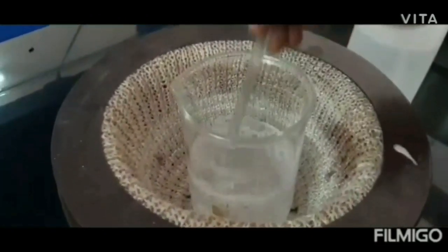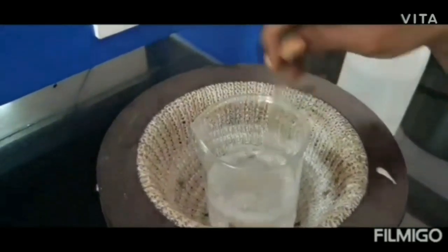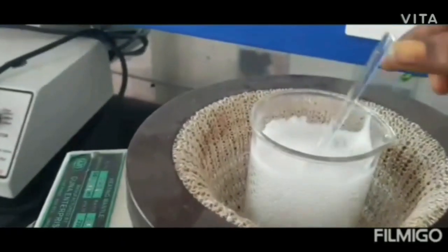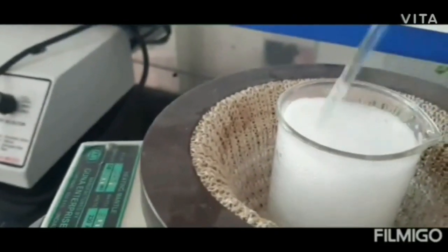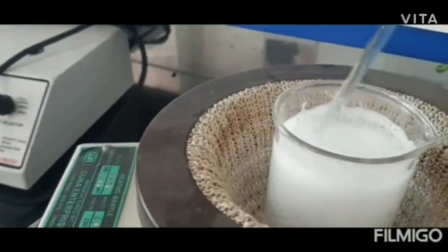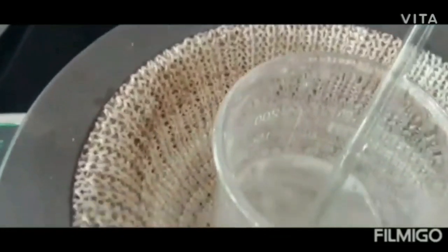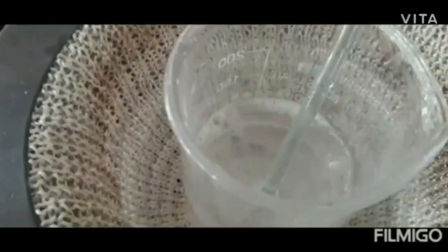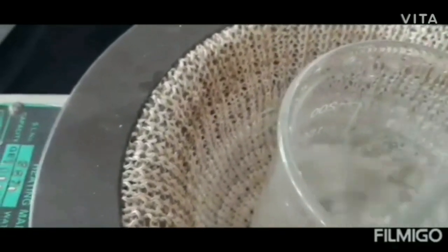PVA solution should not be used when it is hot. It has to be cooled to room temperature. When it is cooled to room temperature, it can be used to prepare the various concentrations like 0.2, 0.4, 0.5, 0.6 and 0.8.